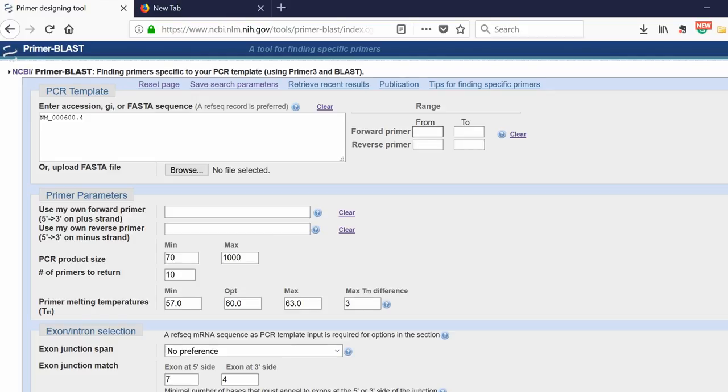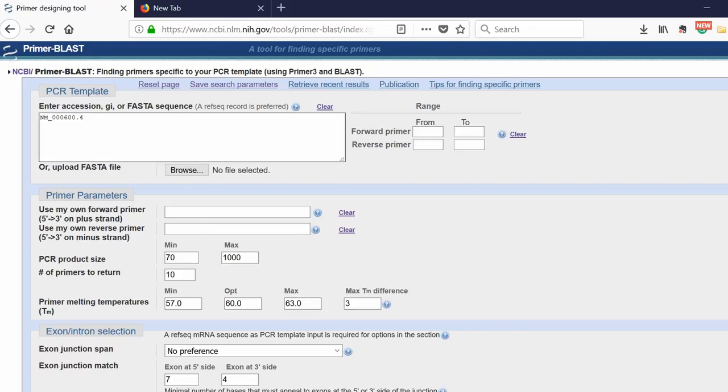You would enter the base pair location here. You can also upload your own FASTA file if you wish. But because we want to design primers on this gene, we're going to leave it associated with the accession number.